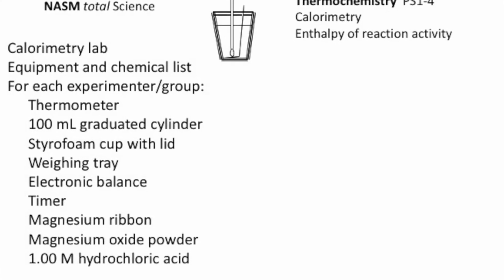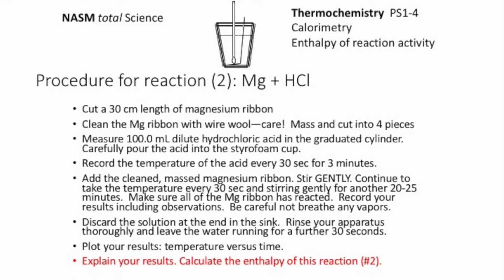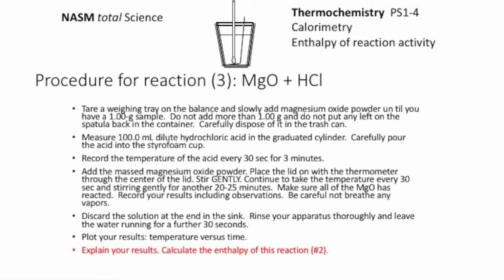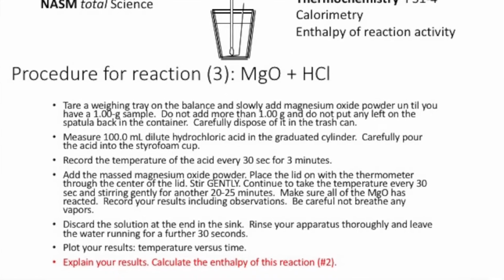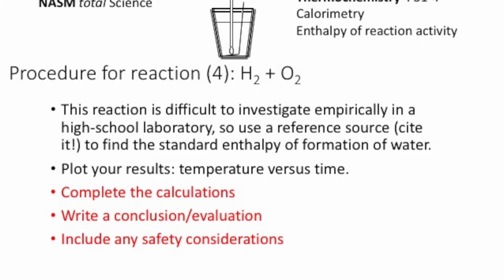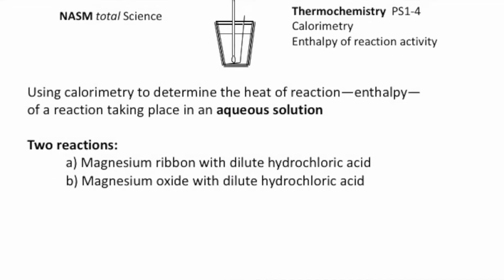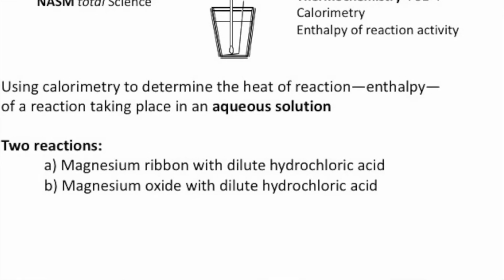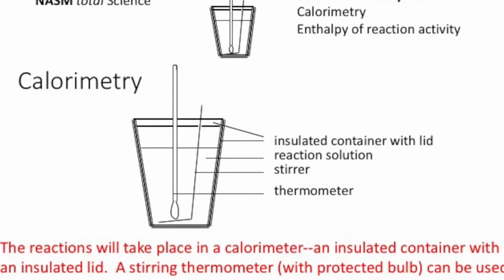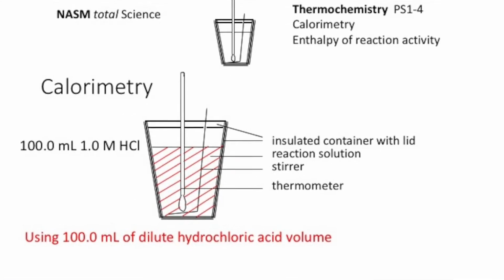You can pause to see the equipment and indeed the procedure. There's a separate sheet you can look at from the website as well. And we're going to do calculations using the heat transfer equation to find this. The equipment we're going to use is a calorimeter.